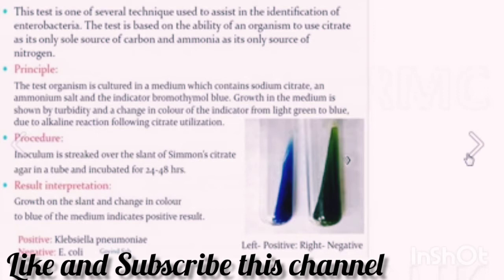Citrate utilization test. This test is one of the several techniques used to assist in the identification of Enterobacteriaceae family. This test is based on the ability of an organism to use citrate as its sole source of carbon and ammonia as its only source of nitrogen.